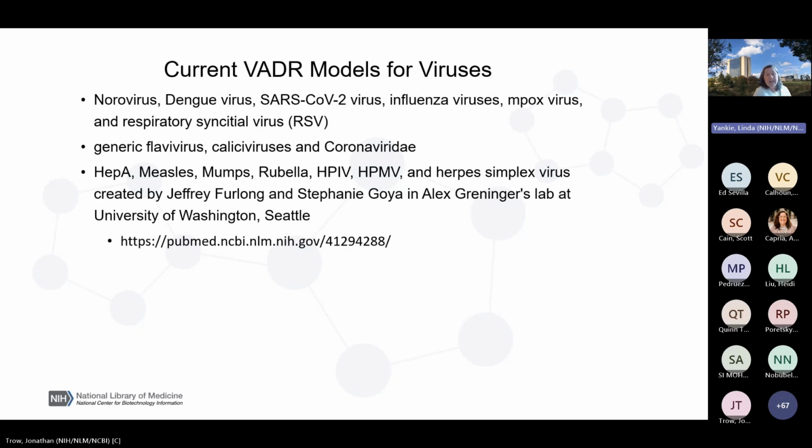VADR was flagging these as problematic. Once we were alerted to the fact that this was an incorrect alert, we were able to quickly update VADR and our automated annotation pipeline to no longer flag these sequences as problematic. Having input from stakeholders is essential to the success of the development, maintenance, and expansion of automated pipelines. We really do want and need your input for this.